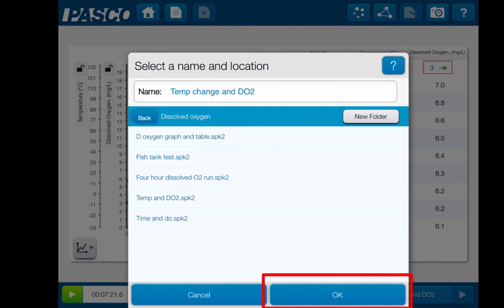You should have your lab saved within the iPad, within the SparkView app. There are different ways that you could explore with respect to how to share and how to upload to the cloud. We could get to that later, or you could simply ask a question. But right now you are ready to run an experiment using more than one Airlink synced to the iPad.